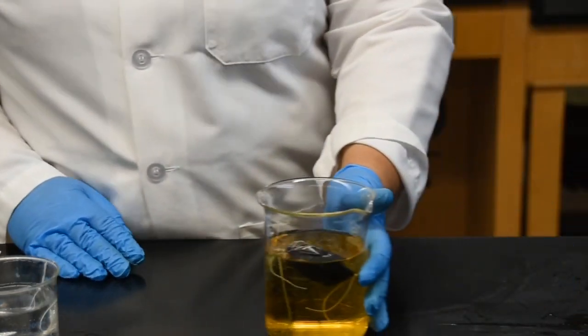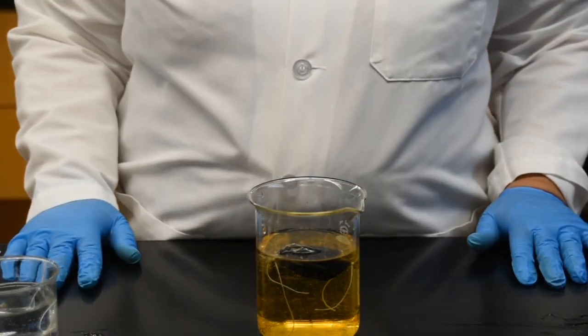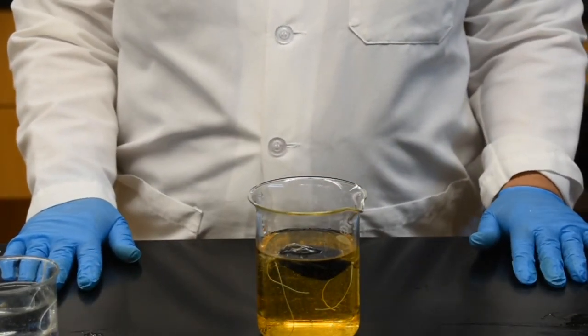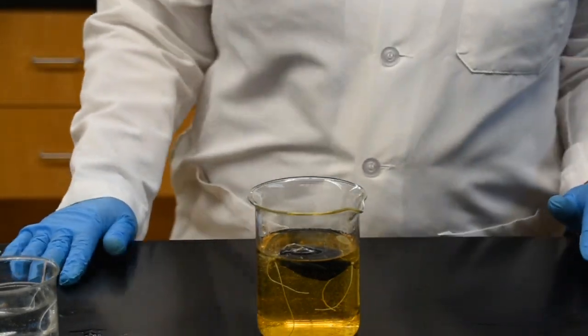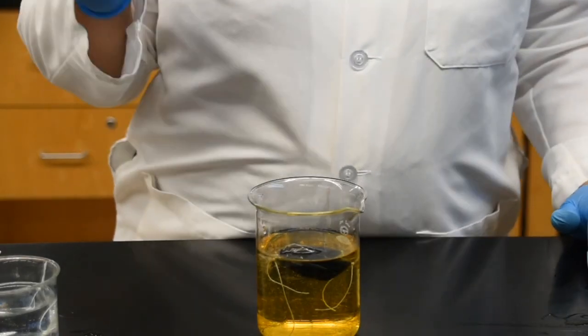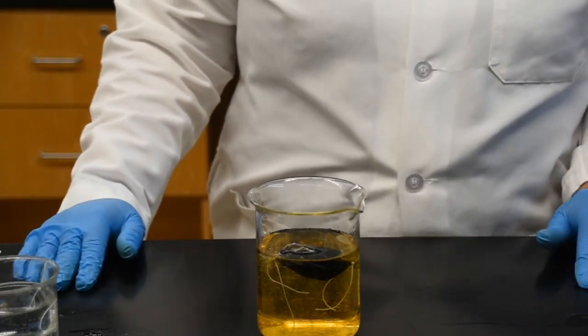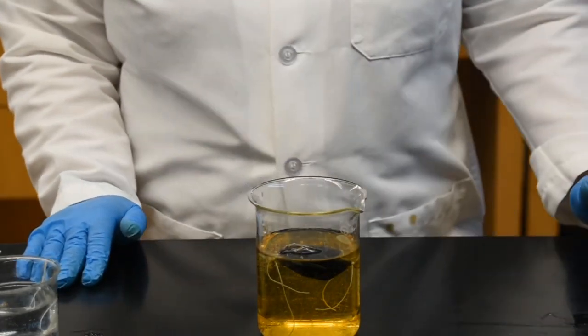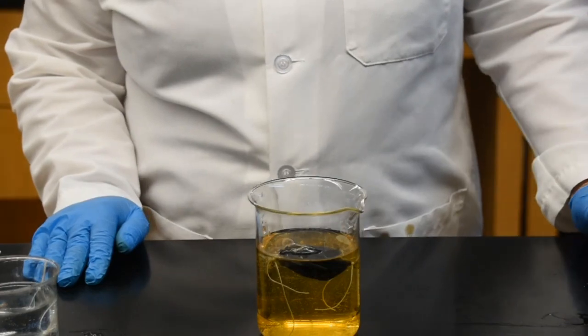Okay, the next one that we did was our experiment to see how size affects diffusion passing through the plasma membrane. Right here, again, we had the original sample. We had a baggie of the starch, which has the weight of 21.5 grams. The original color was cloudy, and the water of the beaker was yellow.